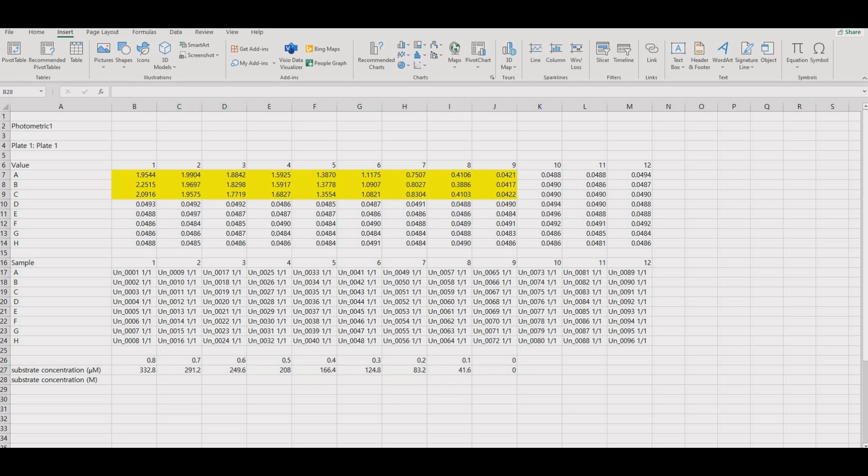We want our units to be in molar, not micromolar, so multiply the values by 10 to the negative 6.